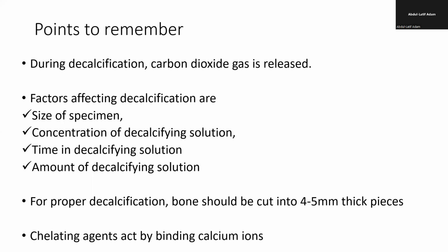Also, you have to make sure that the correct specimen size is achieved. You don't have to make the piece so thick. You have to make it thin to allow penetration. And then the timing is very important. The amount of decalcifier I've mentioned to you, the tissue shouldn't float. It should be immersed completely. And you should make sure that it is completely decalcified by checking the endpoint of decalcification.